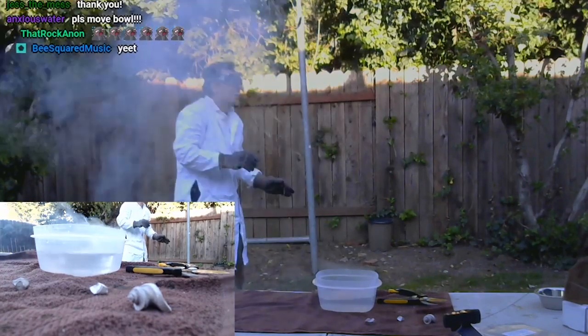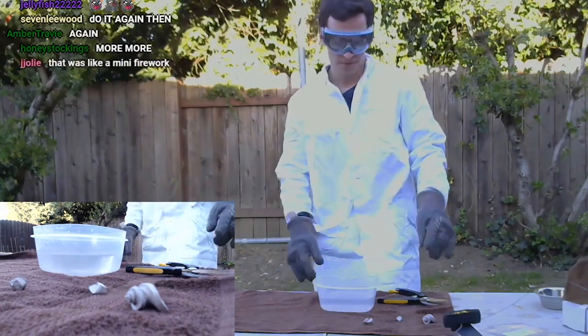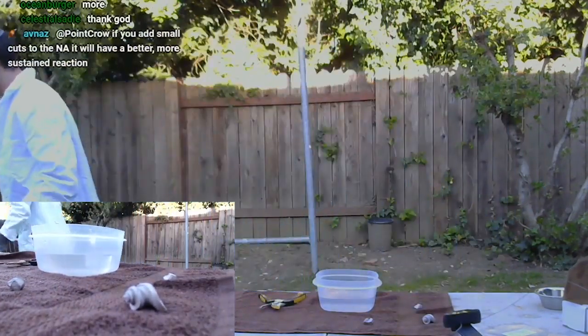Woo! Science! Let me get a smaller chunk than that. We'll do it again. Let me check on bismuth real quick.